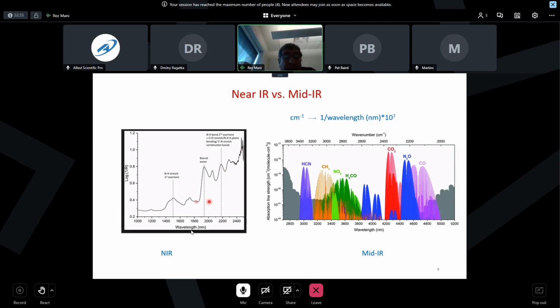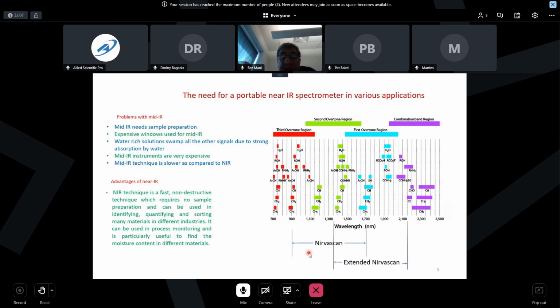So you need some method of analyzing this, and that's why we will be talking about chemometrics, because it's not so easy to analyze NearIR. All the bands are overlapping, the resolution is not that great, and the intensity is lower than mid-IR. But still, it's better to use NearIR if you're looking for a fast method of measurement.